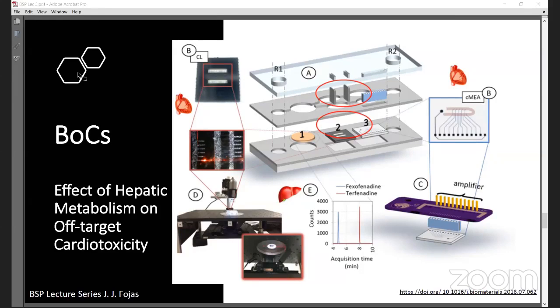And then you have here an elastomeric electronic connector, which was incorporated into the housing to interface the embedded microelectrode array to a custom printed circuit board for electrical measurements. You have stainless steel wire electrodes embedded in your PMMA housing.